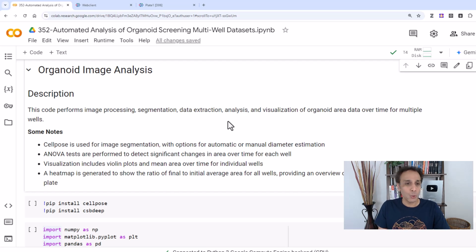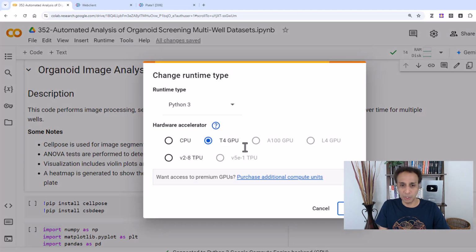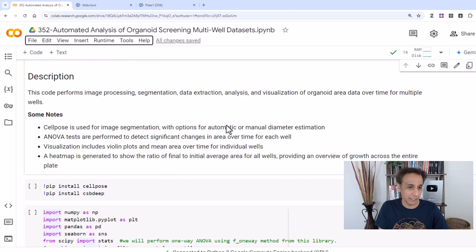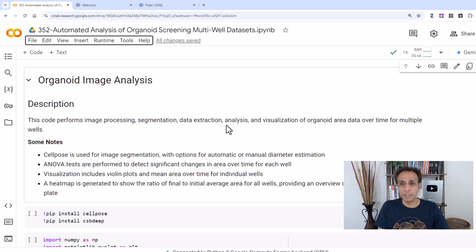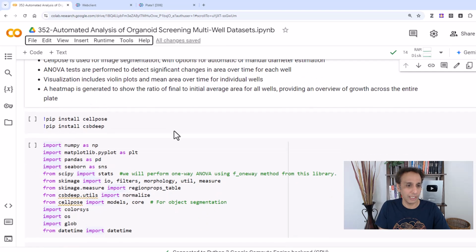Okay, so here you go, and obviously you know that you should change the runtime type and use GPU, whatever GPU that they give. I'm recording this early 2025, like January 2025. Probably the video will be out in February after finding some time for me to edit this and everything. But whatever the resources you get, I'll print out the GPU information. So if you want, you can check that out.